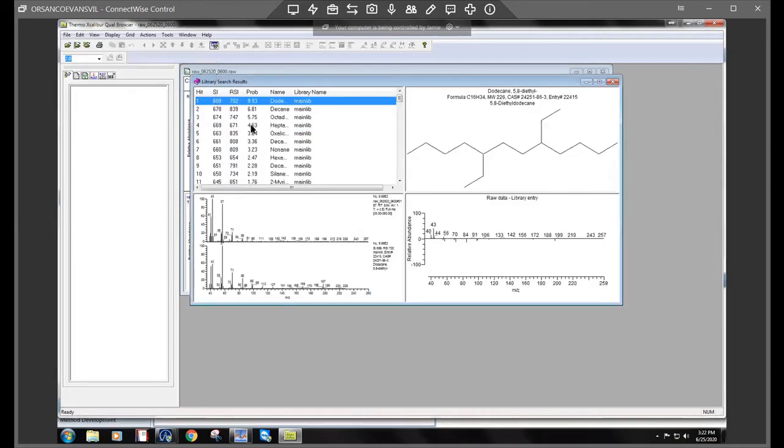As you see, the values are not that great. 600, 700, you know, can we trust it? Not sure.